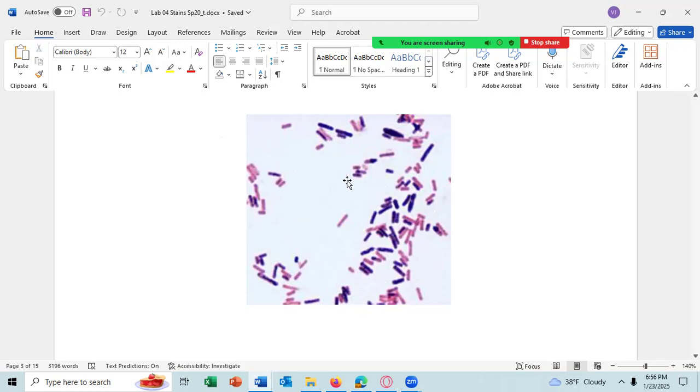this looks kind of weird. How old are these cells? And they've always told me that the slide used cells that were at least 2 weeks old or older. And then I tell them, okay, to get a proper gram stain, you have to only have cells that are 2 days old or younger.